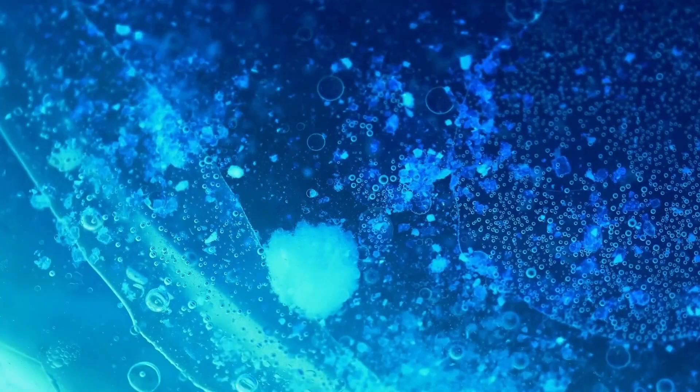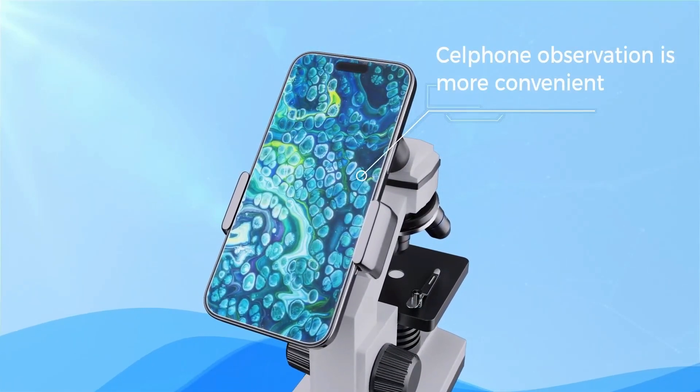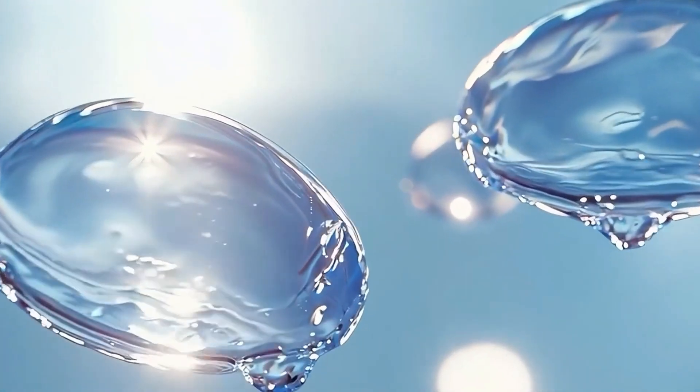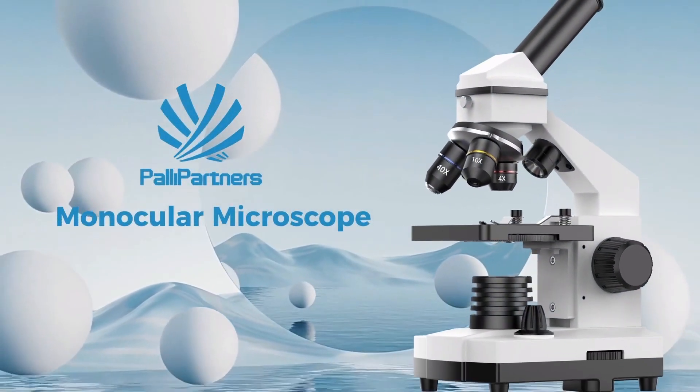With settings ranging from 100X, 250X, 1000X, 200X, 500X, all the way up to 2000X, this microscope is perfect for examining specimens with the clarity and precision you need.